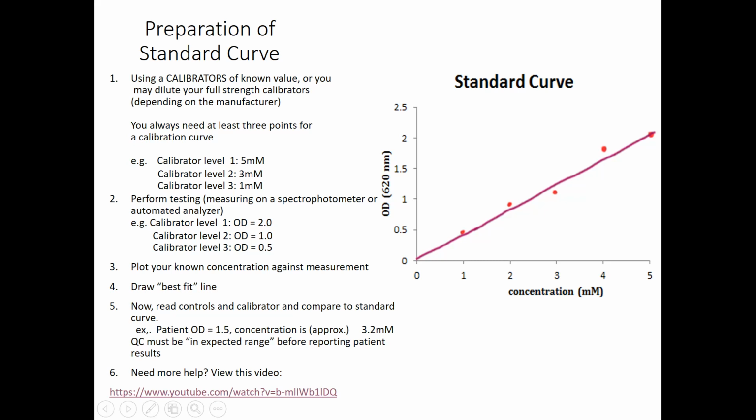So we're looking at our highest point and drawing it down, and seeing we're going to use this as a point, this is a point, this is a point, and this is a point. So you can see this is a little bit below. We also ran a couple of others. We made some dilutions off of this 5 or the 3 for this one.